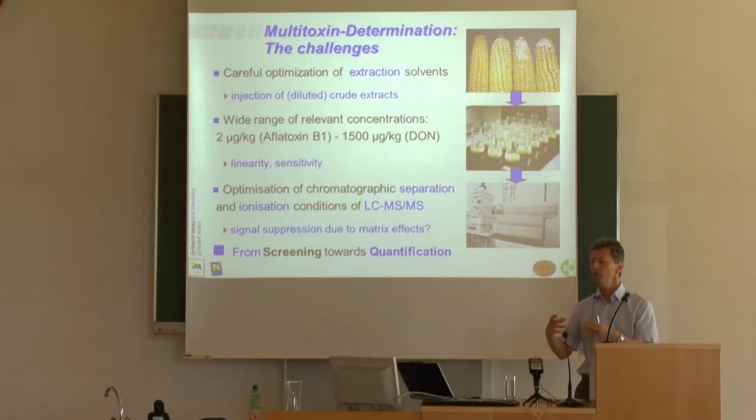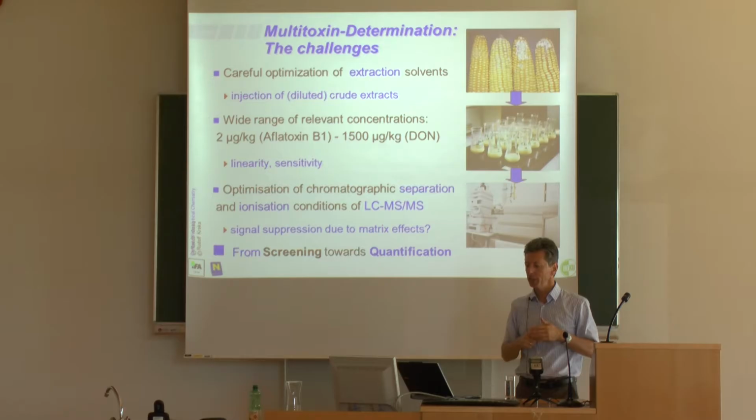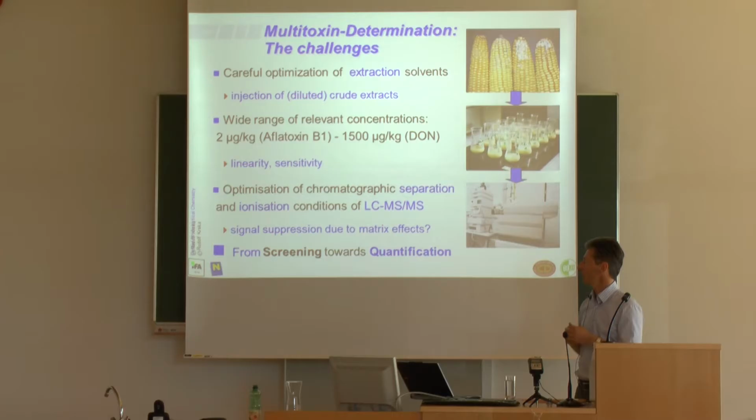So the idea is to get rid of the matrix components by diluting the matrix effects to a level where they almost disappear, while at the same time ensuring that there are still a couple of mycotoxin molecules left, which are still feasible to be detected by sensitive LC-MS/MS methodology. We've got a wide range of relevant concentrations.